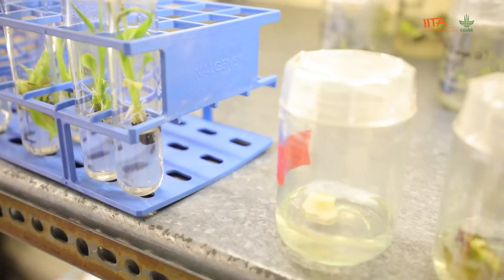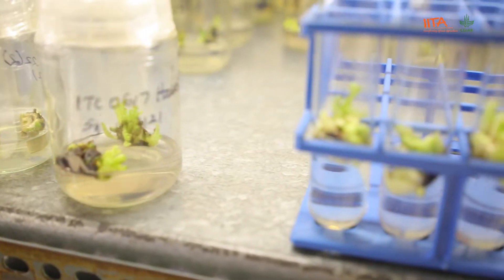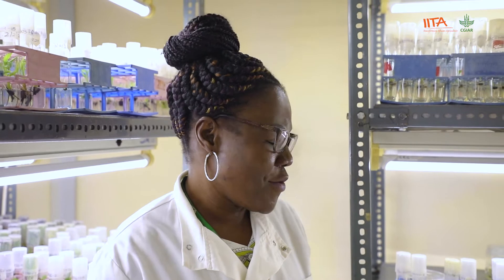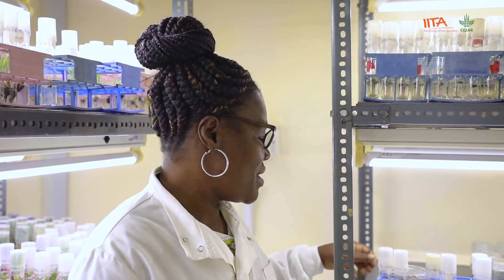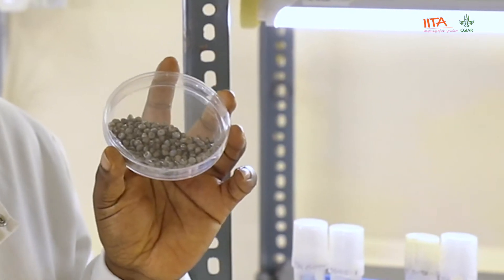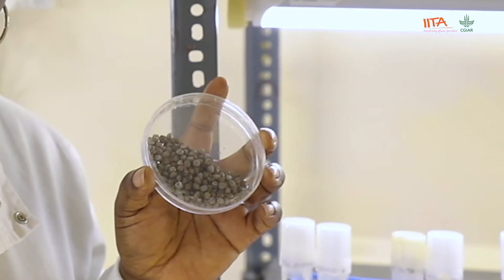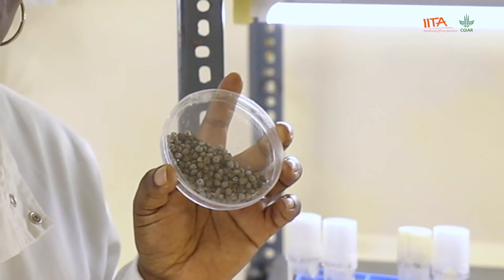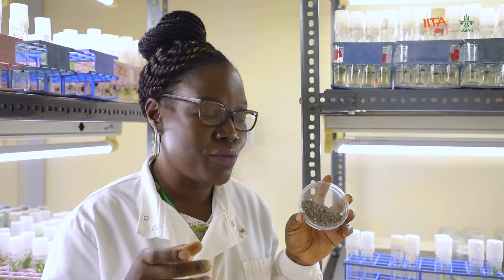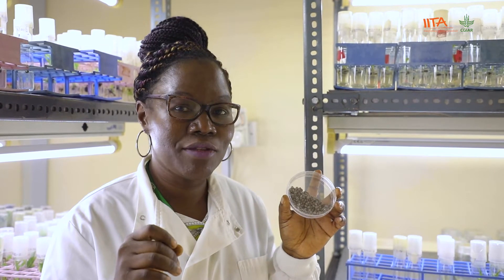Here is our tissue culture room. Tissue culture is a process where you grow plants on artificial growth media inside test tubes. We use that technique to germinate seeds from crosses. As a breeding program, we make crosses to bring in resistance from wild material to the material that we want to improve. When we get the seeds, it is normally difficult to germinate them.